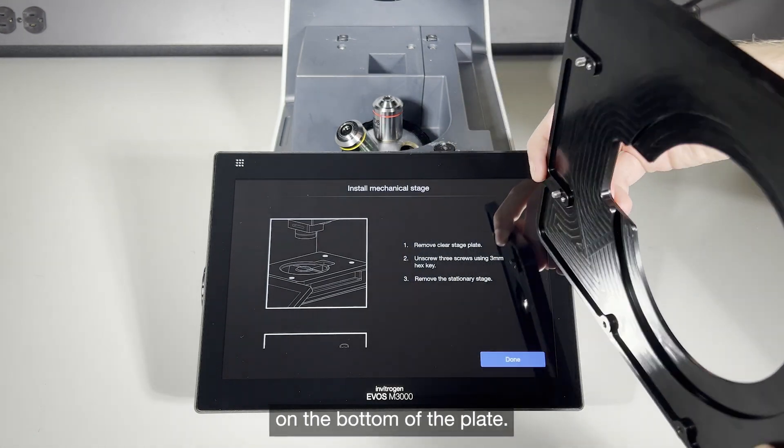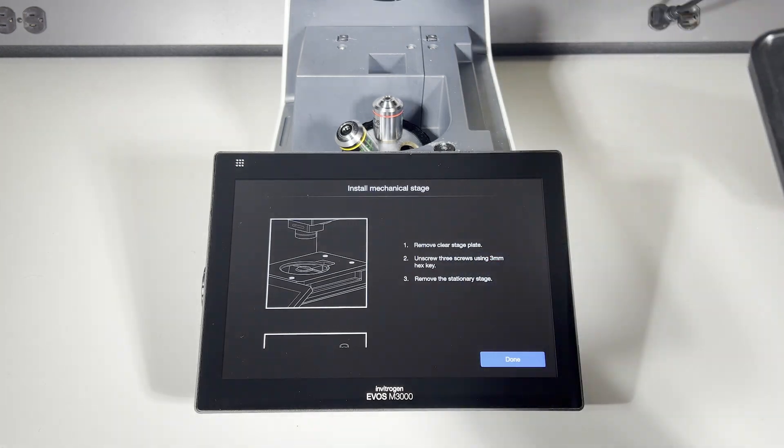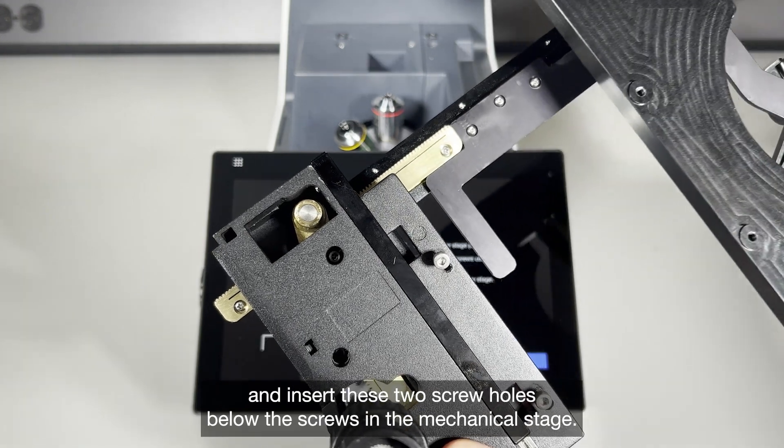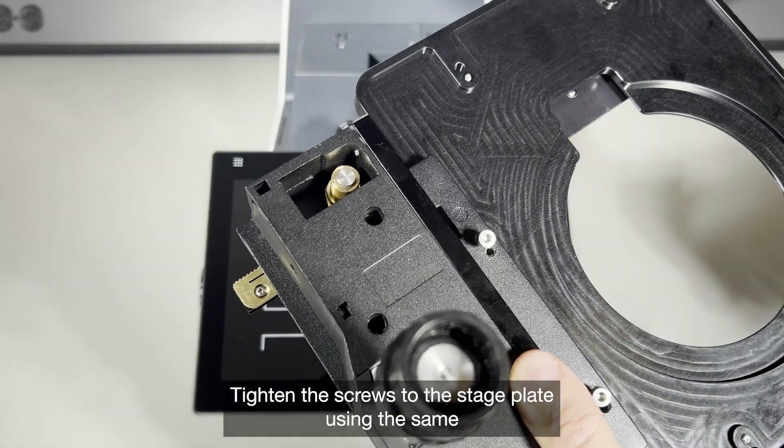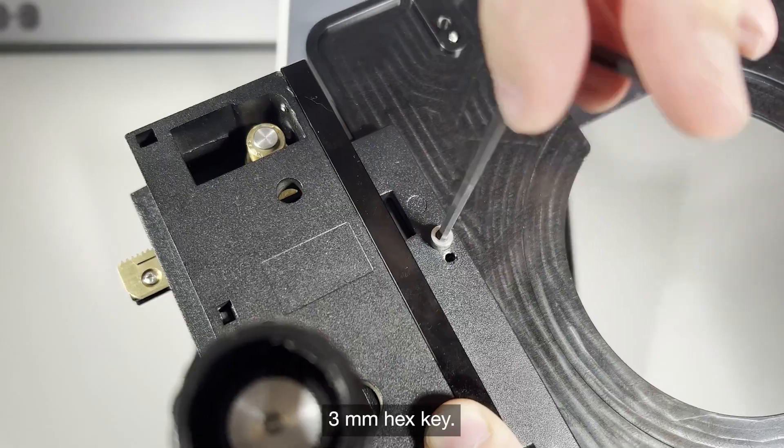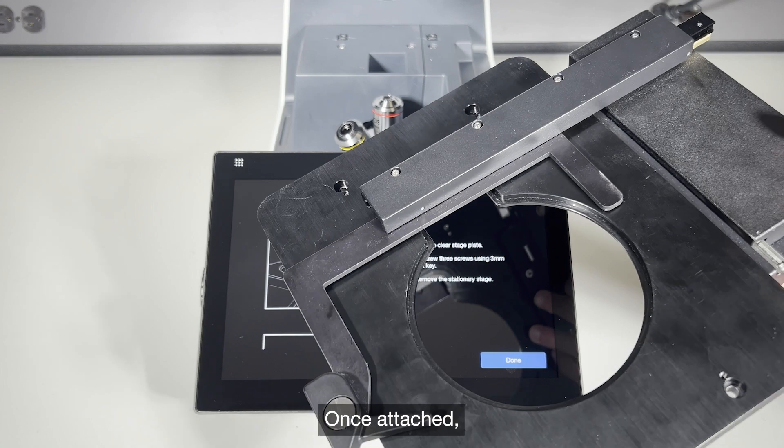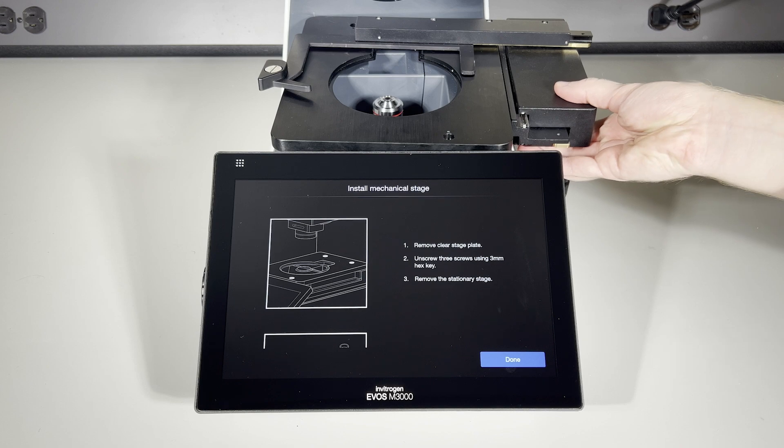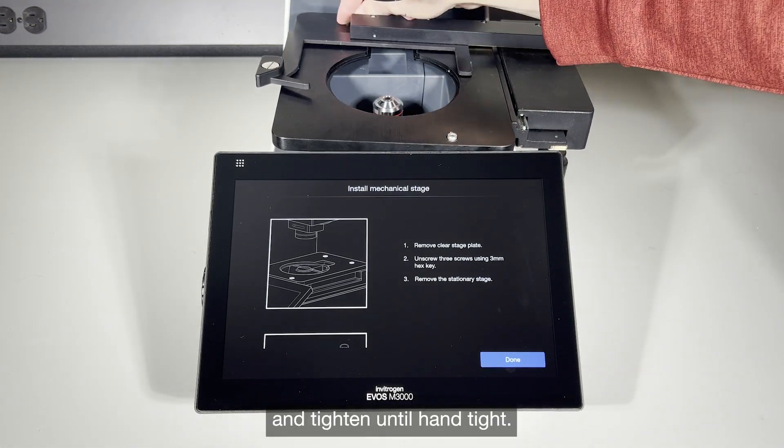Locate the two new screw holes on the bottom of the plate. Retrieve the mechanical stage and insert these two screw holes below the screws in the mechanical stage. Tighten the screws to the stage plate using the same 3mm hex key. Once attached, place the stage plate back on the system in its original orientation. Replace the three screws you removed at the beginning and tighten until hand tight.